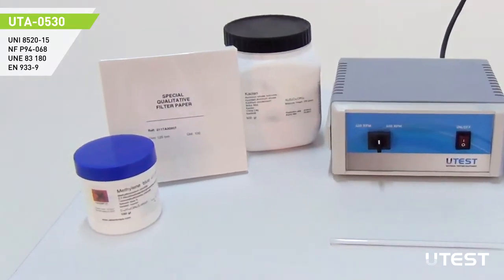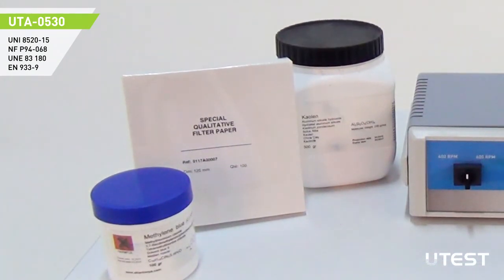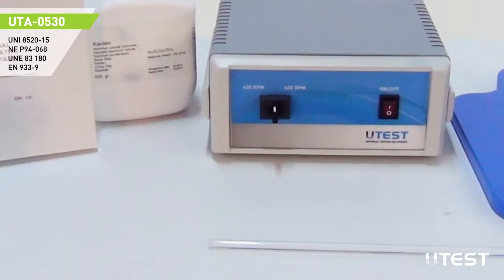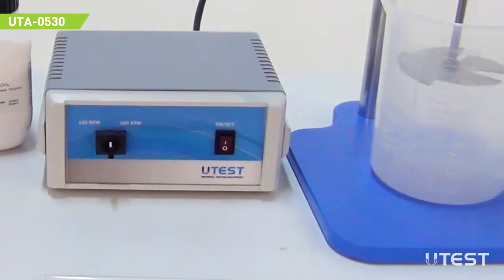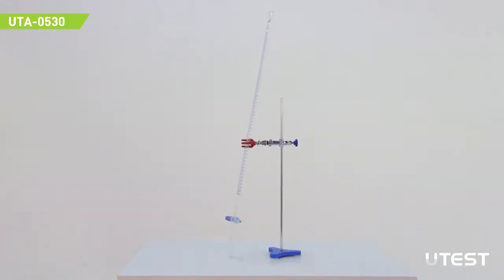Set also includes 100 gram methylene blue powder, special filter paper, 500 gram kaolinite, a glass rod, 1,000 ml plastic beaker, a glass buret and its stand.